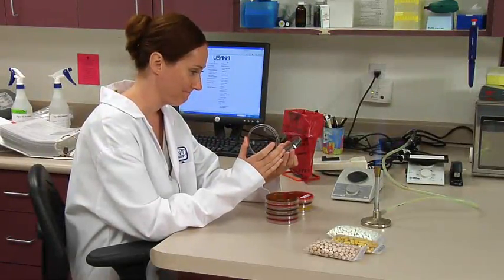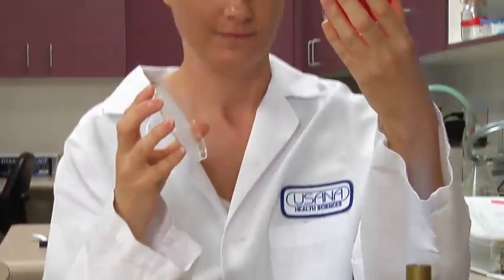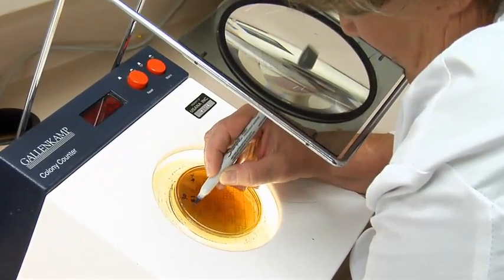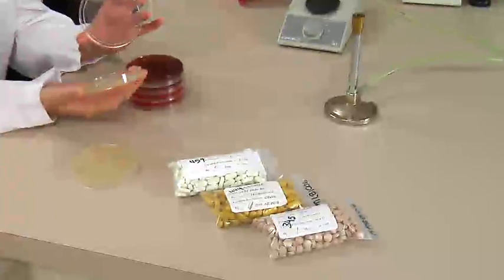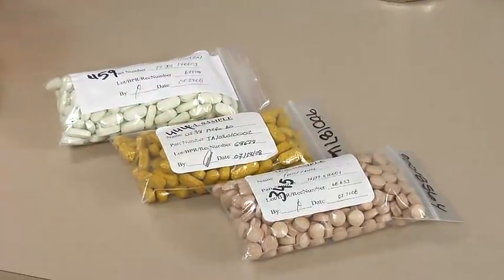In addition, our quality control laboratories include a microbiology section. Before manufacturing can begin, incoming raw materials are quarantined until samples are taken and tested for biological contaminants such as Salmonella, E. coli, Staphylococcus aureus, mold and yeast. Only after passing all of these tests are the raw materials approved for use in USANA products.